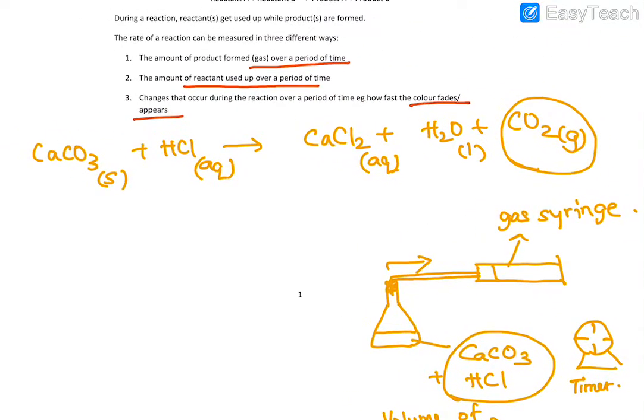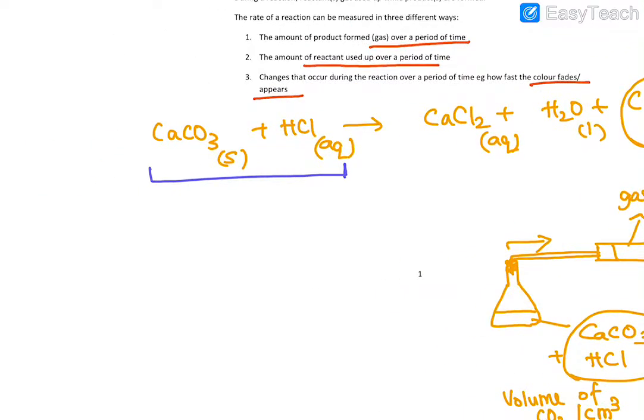Now, another way that we could use to investigate the rate of reaction is by looking at the reactants. Because we have a gas that is going to be liberated, so it goes away, if we allow it to escape, we'll have a decrease in mass of the system because the gas is escaping. So we can measure the total mass of the reaction mixture with time.